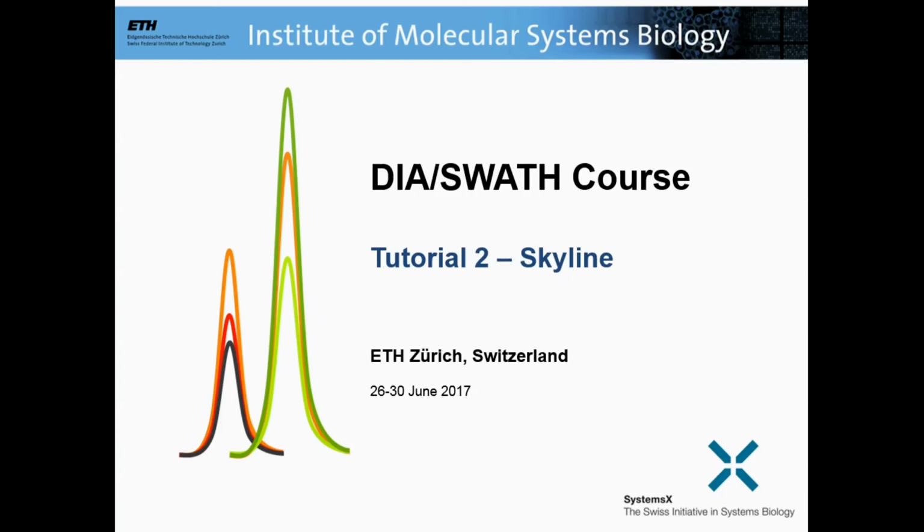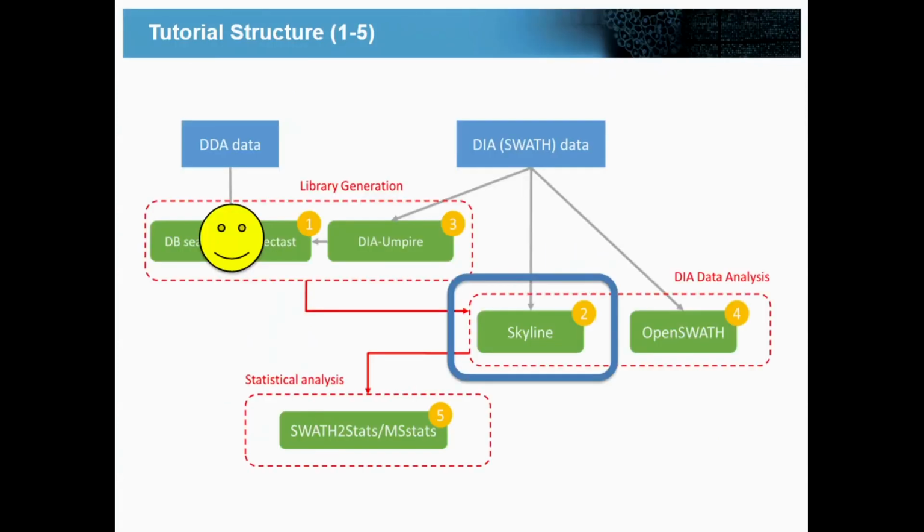Okay, cool. So just a few quick remarks to help you get going with the Skyline tutorial. This is where we are now in this tutorial workflow. I put this picture of the smiley face guy to indicate that we finished tutorial 1. I don't know whether this is really appropriate or not, given the trauma of last night and the command line and running Comet and stuff like this. But anyway, this one is done, and this is what we're doing next. So we're on to Skyline.